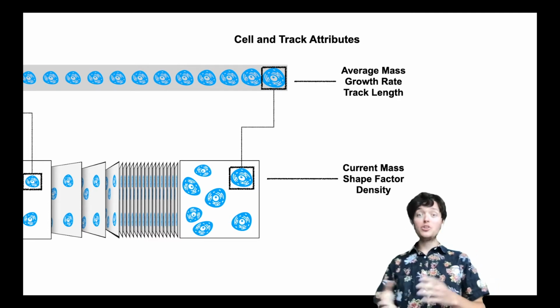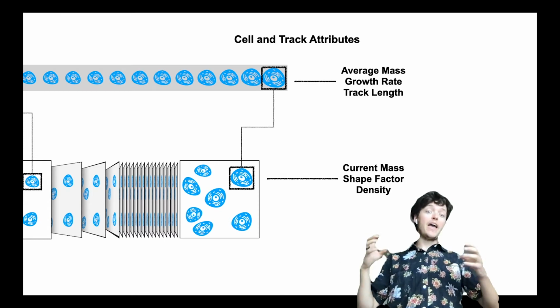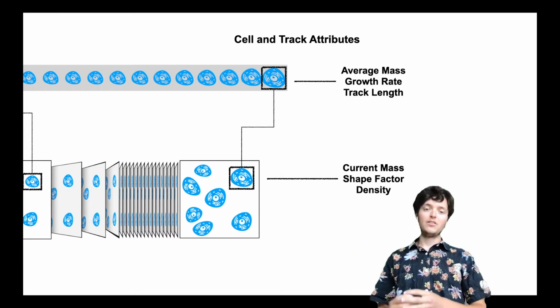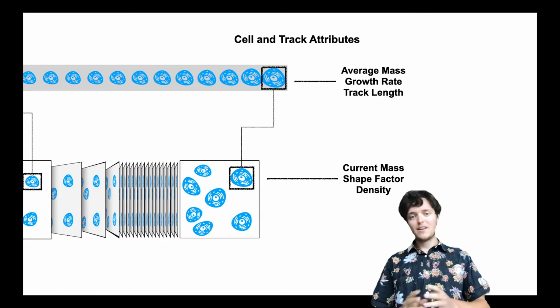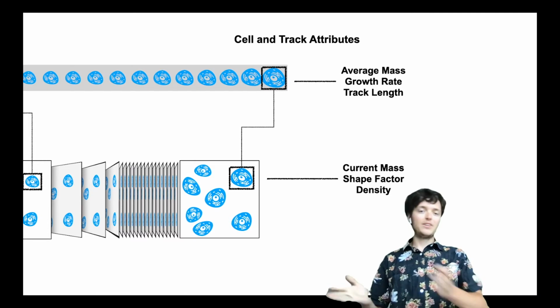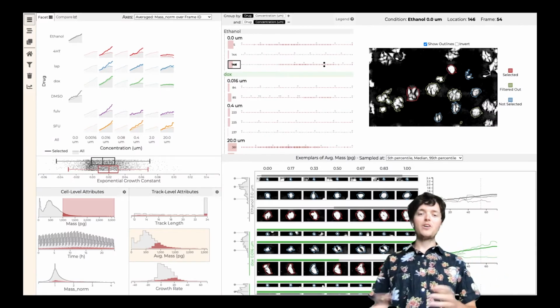Now, because this is a new technology with many complicated steps in the process, our collaborators would like a way to analyze this set of images and associated metadata in a way that they can look for comparisons and analyze things, as well as look for problems that they find in the data that are indicative of issues in some step in this process. And that's where we came in and developed this tool that we call Loon.